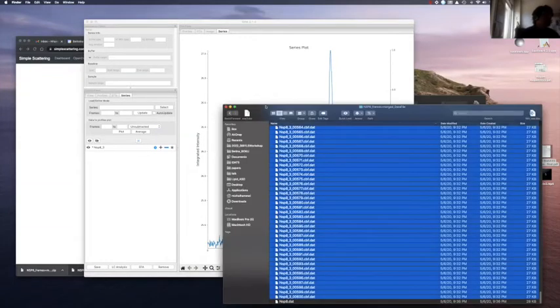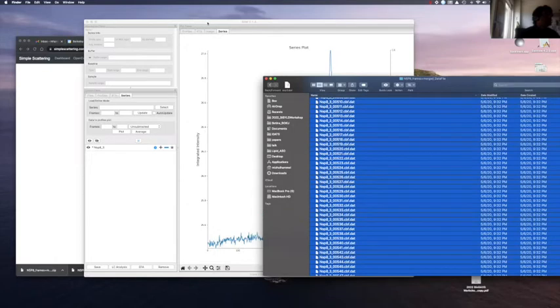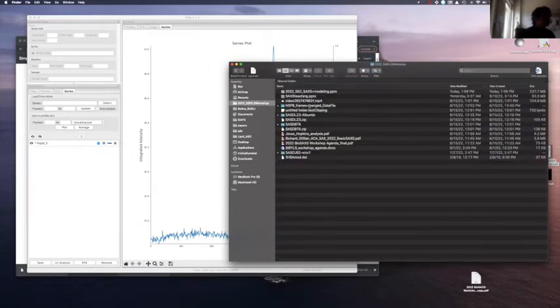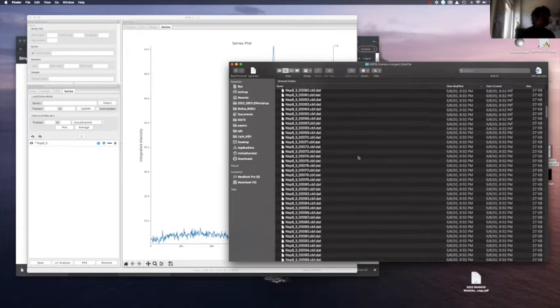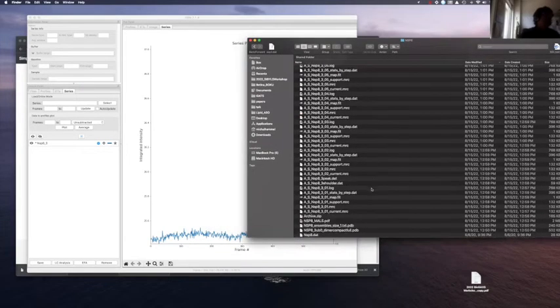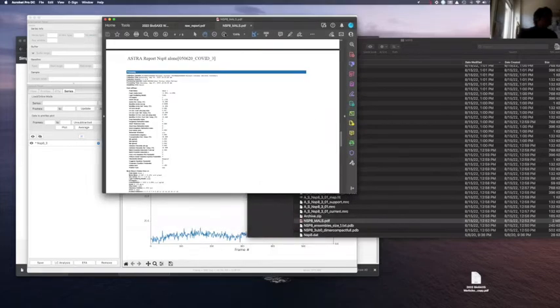What I also recommend before you look at the SAXS data is that you look at the MALS data report that we're also sending out. So here is the report for the MALS data. You will get a bunch of data sets that are the raw images, but you also get a PDF file and a README file so that you know what this means. There is the so-called NSP8 MALS PDF file, which is a report in PDF format.